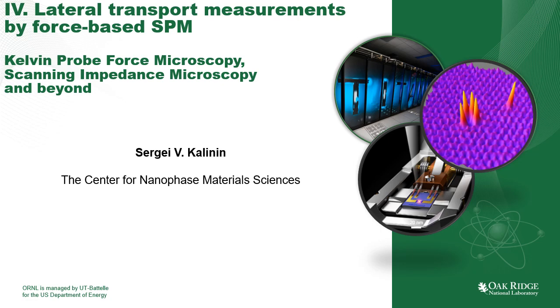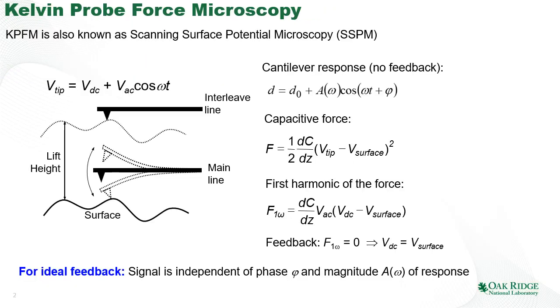So this includes topics such as the Kelvin probe force microscopy of the laterally biased devices, its extension to the time-resolved KPFM, and the KPFM analogs that operate in the frequency rather than time domain, such as scanning impedance microscopy and beyond.